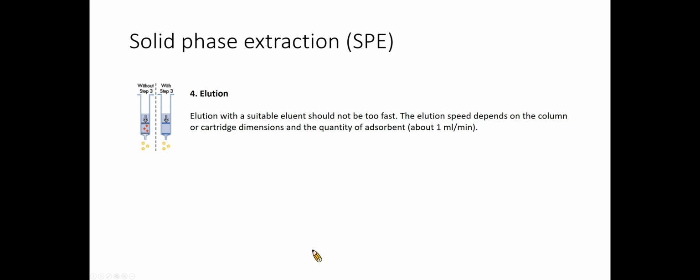The final step is elution. In this step, the analyte shall be eluted using a suitable solvent. The elution speed depends on the column or cartridge dimensions and the quantity of adsorbent.